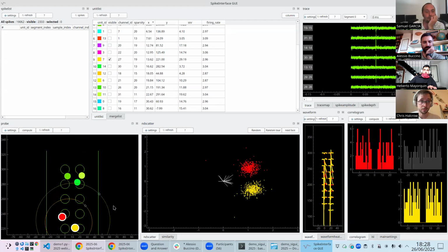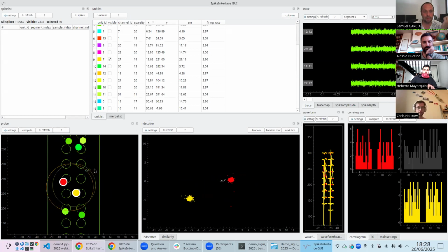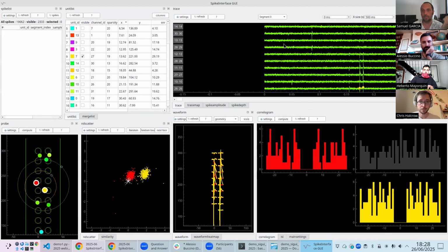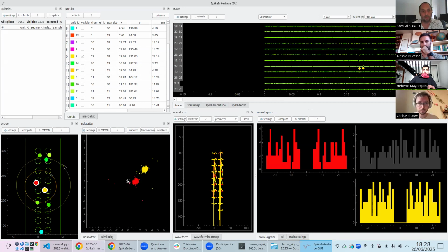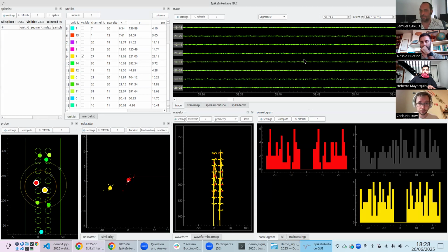You also have a concept of channel visibility, which is the external circle. The more channels I have, this changes the view. And let me introduce the trace view. If you have many channels, sometimes you want to see fewer. Every unit has a few channels around it to describe the spikes, and that's what we have. So we have a trace view where the number of channels can be controlled by this. And here you can see that we have a very fast, let's say quite fast, depending on where your data is stored, way to explore the entire traces of your data.